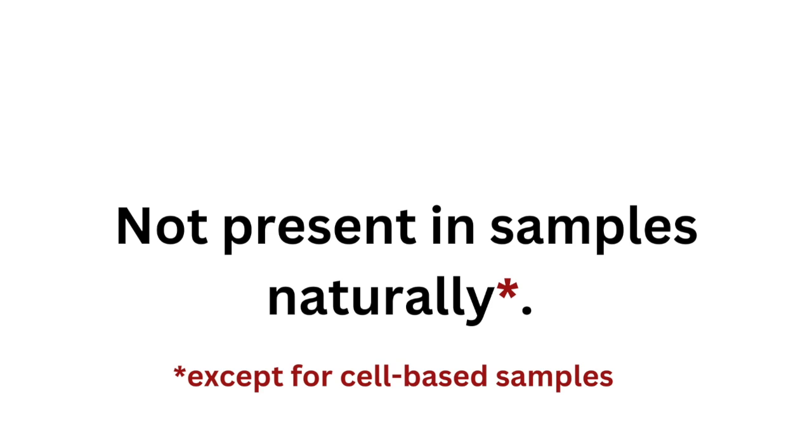The internal standard should be chemically similar to the analyte, but not present in the samples naturally. It compensates for any losses and ensures more reliable results.